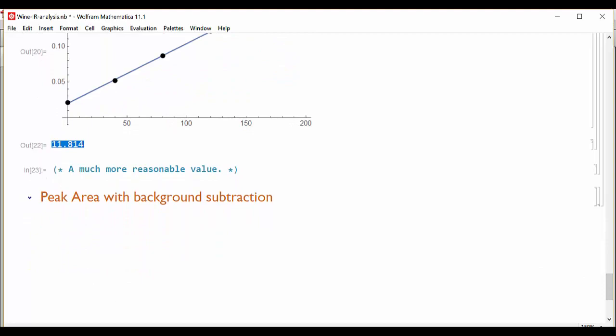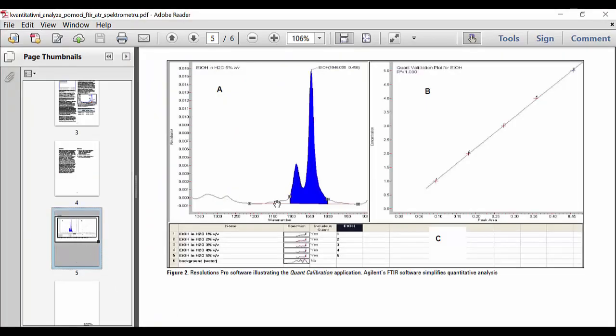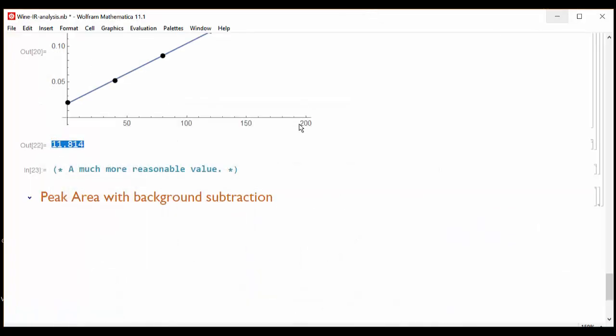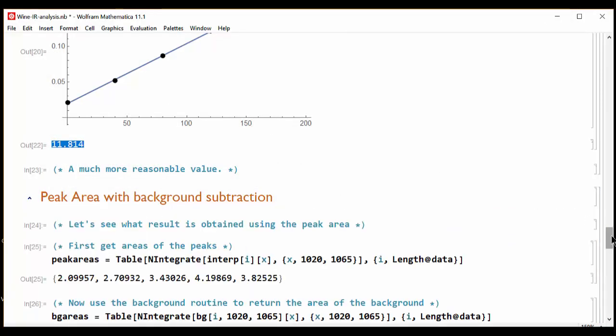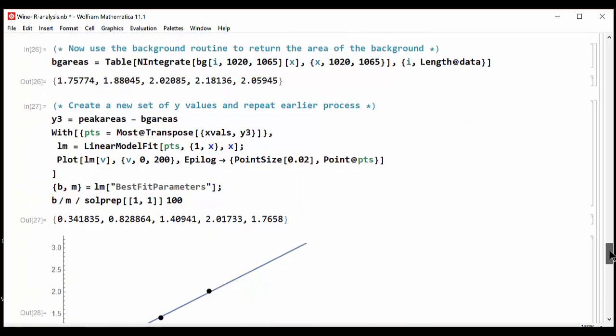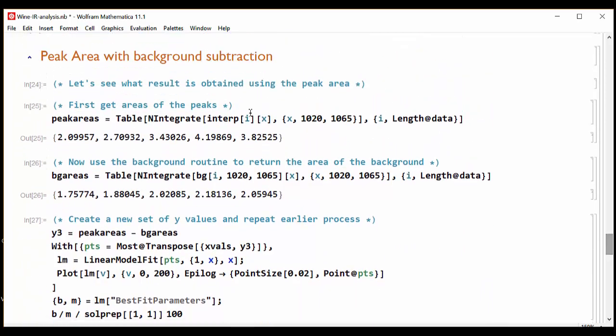Now if we saw in the application note, they are actually performing an area calculation as opposed to a peak calculation, so I am going to try the area calculation to see how that works. Building upon the previous work, now what we need to do is create an area function. So we are integrating the plot from 1020 to 1065. So those are the limits of the one peak.